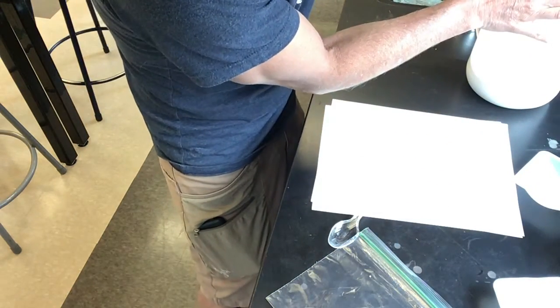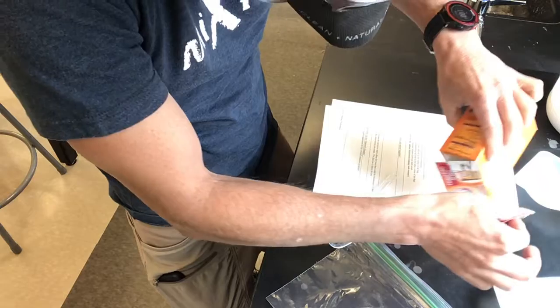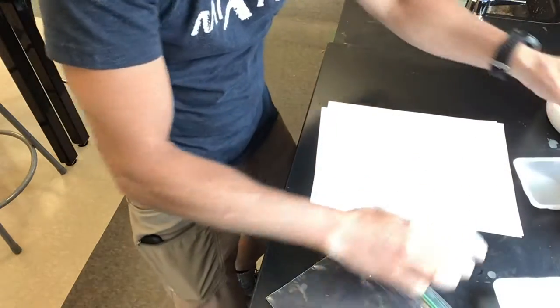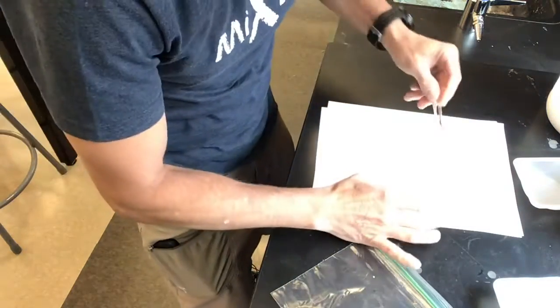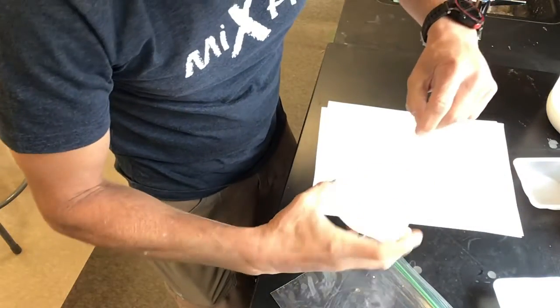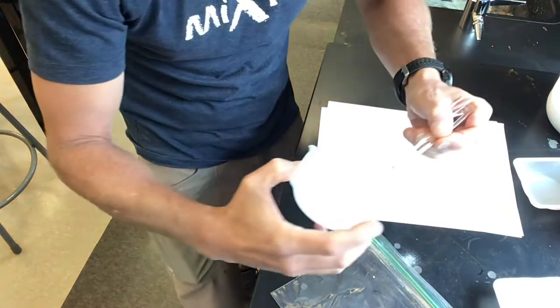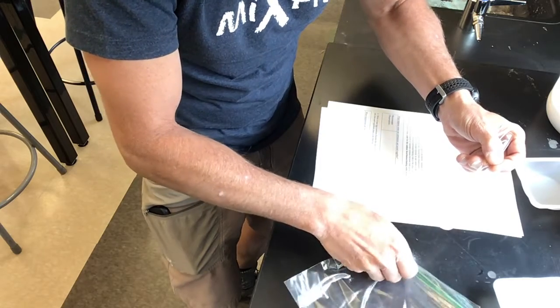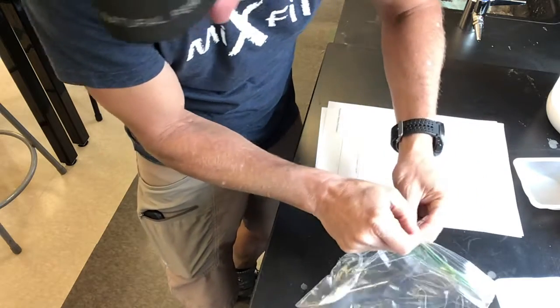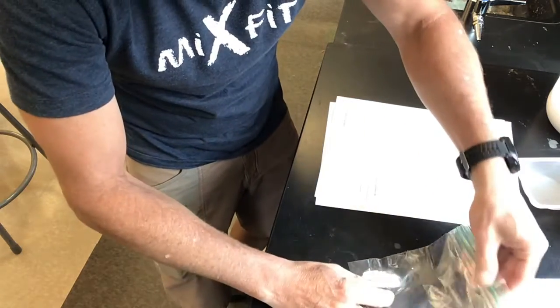You will then add half a spoon of sodium bicarbonate. Let's see here. Might be easier to do it like this. And I'm going to put it on the other side of my bag.